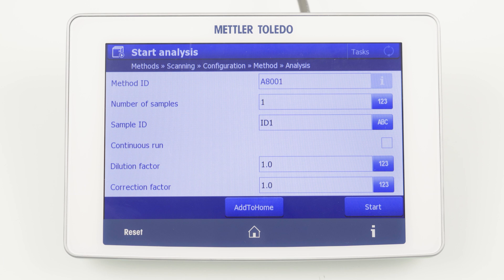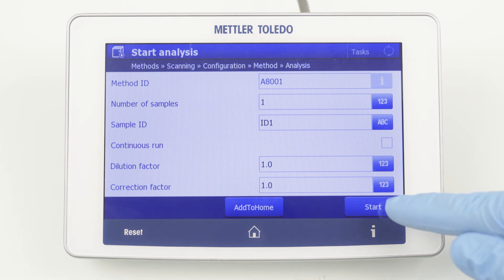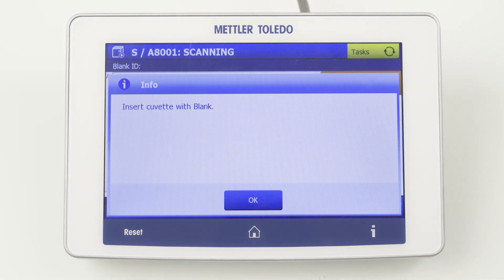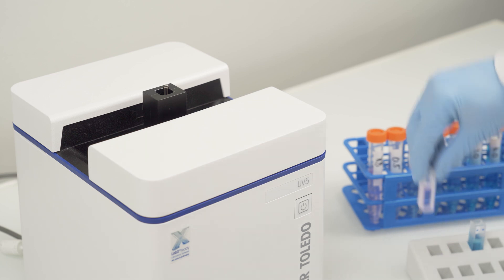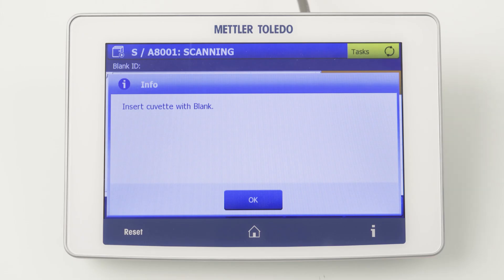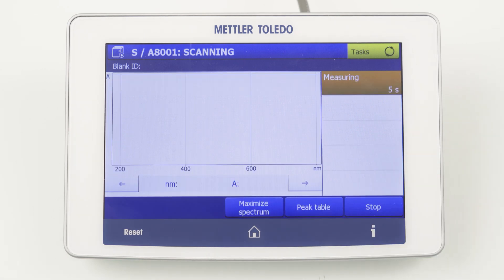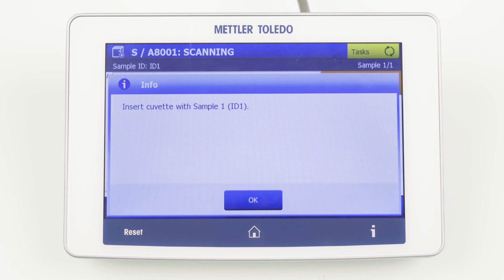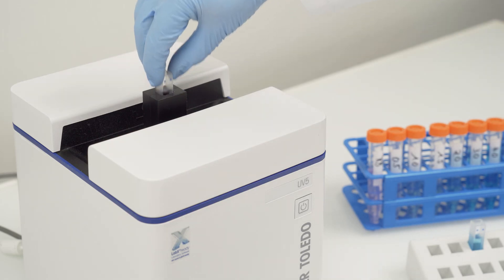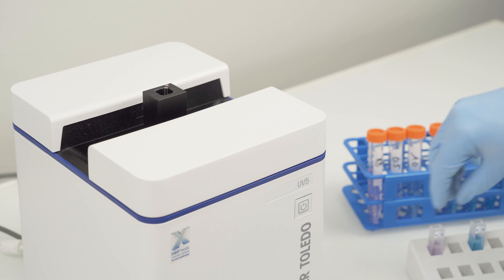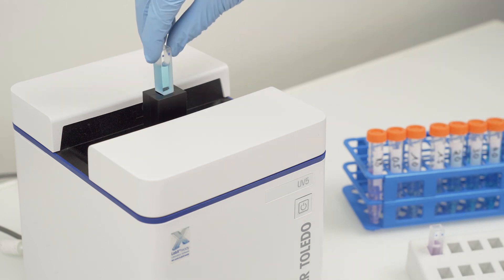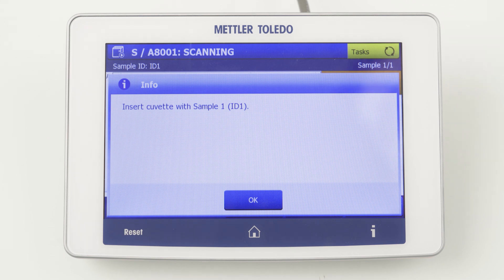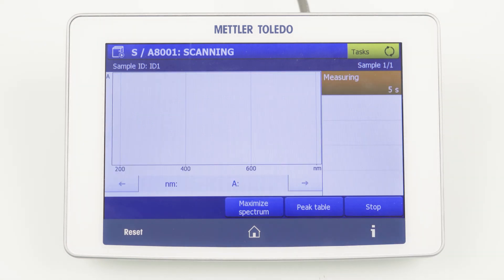This is explained in detail in our How to Measure Color video. Click Start again and you are guided through the workflow. First, we have to insert the blank cuvette. By clicking OK, the blank determination starts. Afterwards, we are asked to insert the sample, and by confirming the pop-up, the measurement starts again.